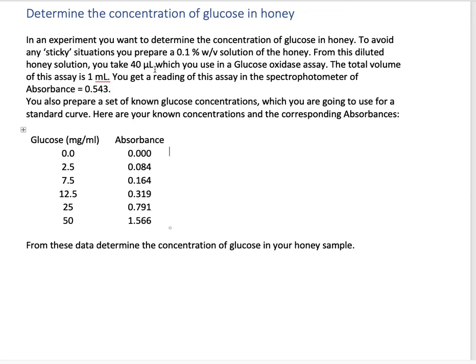First, we make a 0.1% weight per volume solution of honey to avoid any sticky situations. From this diluted honey solution, we take 40 microliters and use that in a 1 milliliter glucose oxidase assay.